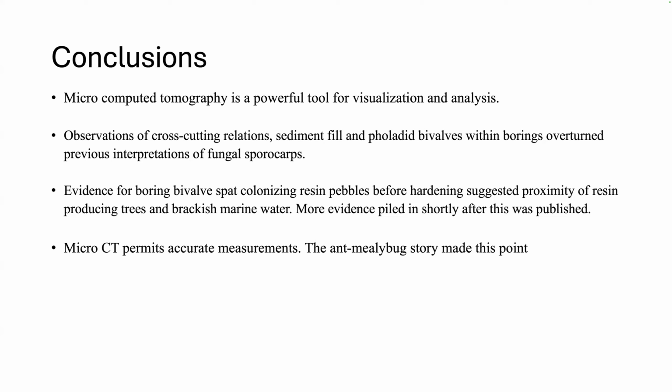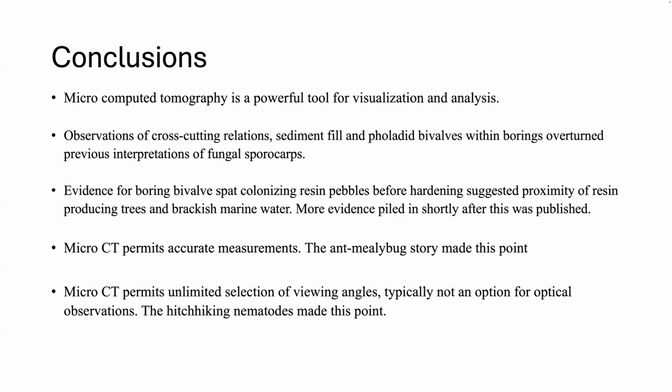So we can make accurate measurements, and that was the point in the ant mealybug story. And that selection of unlimited viewing angles is really important because very often you find that you're very restricted in what you can see, and you miss a lot. Or there's a potential for not seeing a good proportion of what's actually there in the specimen. And that's the final conclusion. Sometimes really big deductions can be made from little specimens.